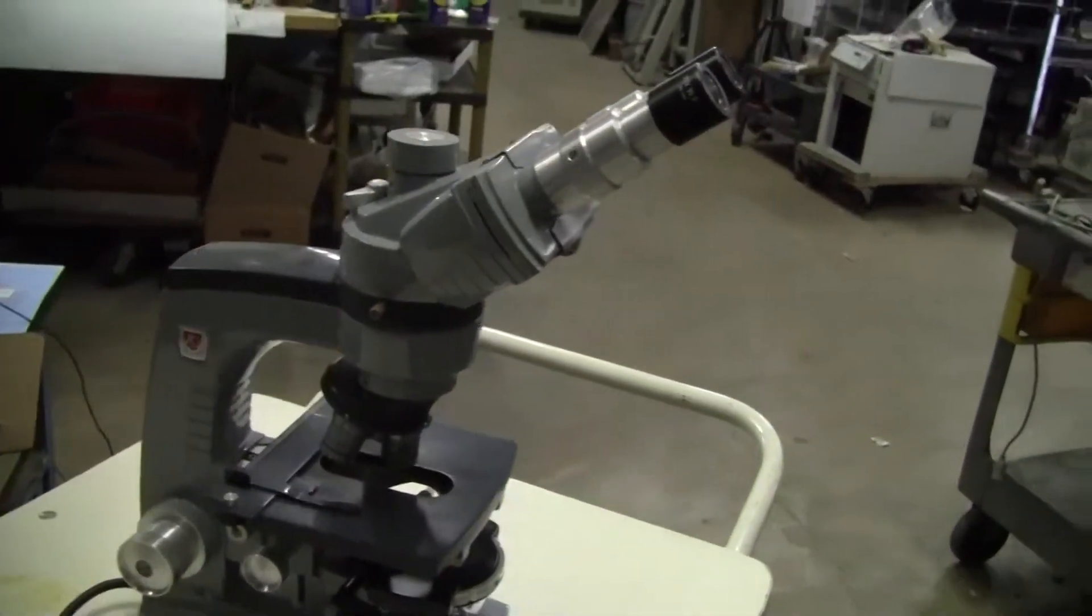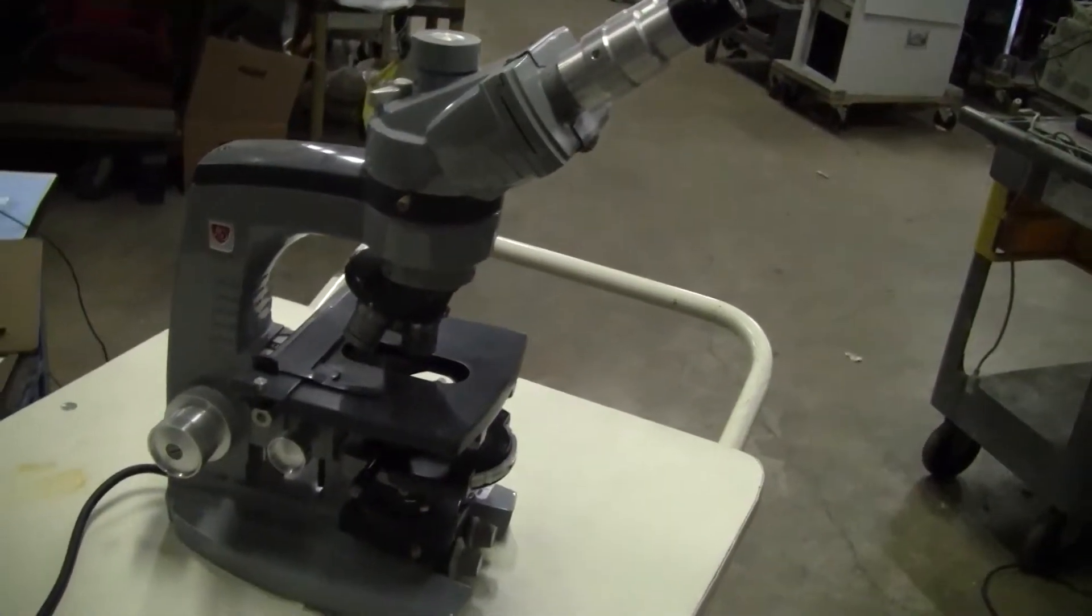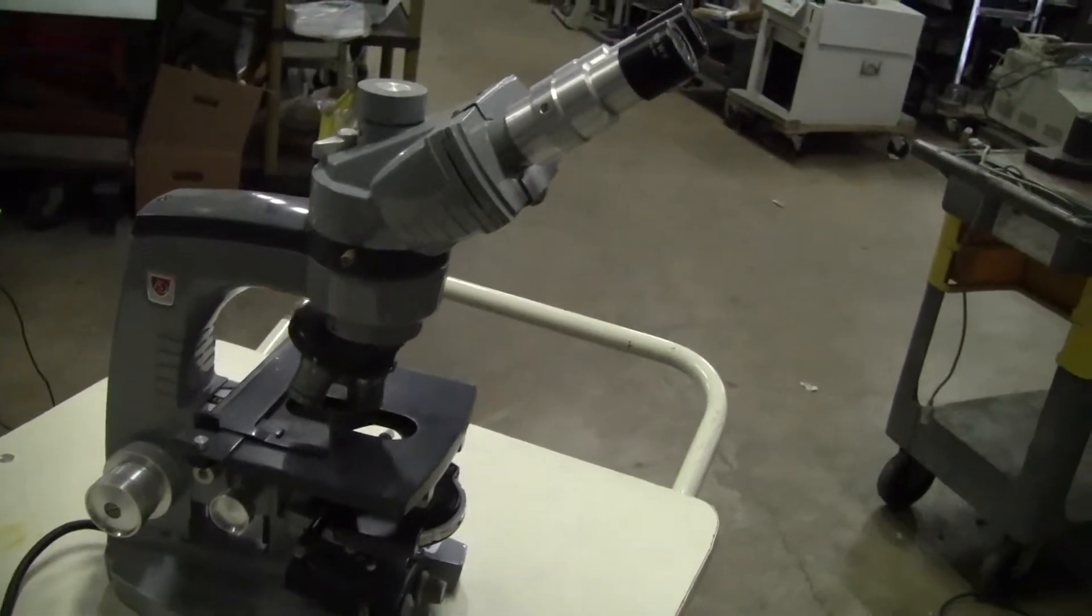Hi, this is Jim from HitechTrader. We're looking at an A.O. Spencer Illuminator 1031 microscope.